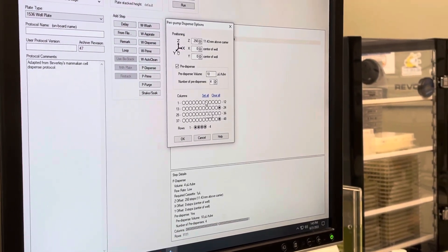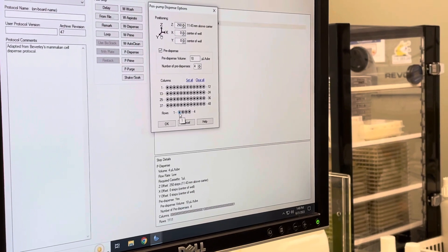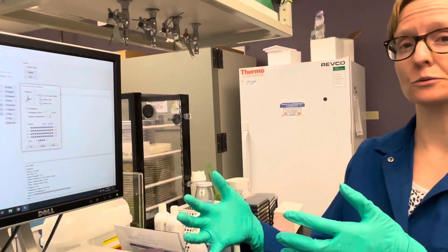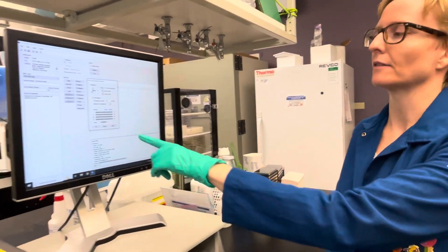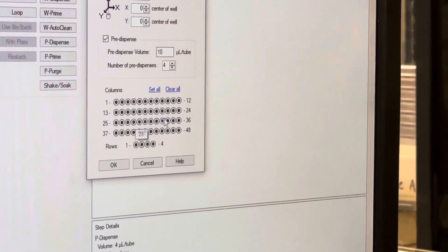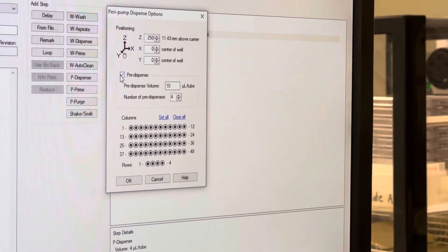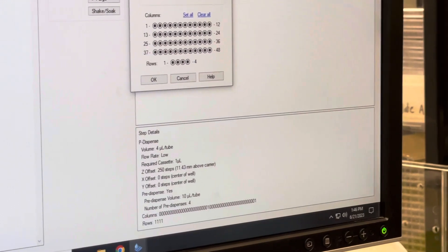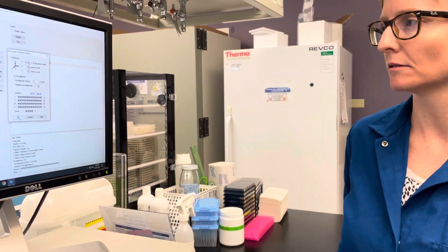There are also advanced options where you can set which wells you want. I'm just going to say all the wells. Because it's an 8-channel dispensing head and a 1536 well plate has 32 rows, each tube actually goes to 4 rows on the plate. So you have an option to say which of those rows you want dispensed into, and you can also pick which columns it does. You can choose if you want a pre-dispense — that's a little mini prime before it dispenses to help get rid of bubbles. And you can change the positioning, which is important if you have different types of plate plastics, or if it's not dispensing in just the right spot.